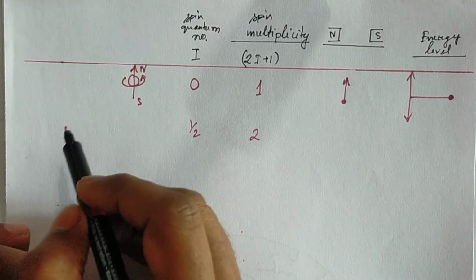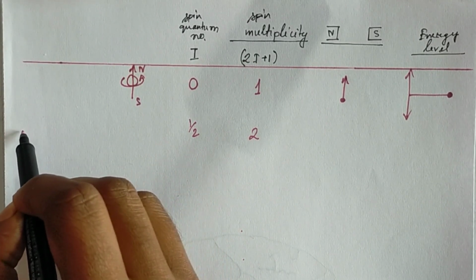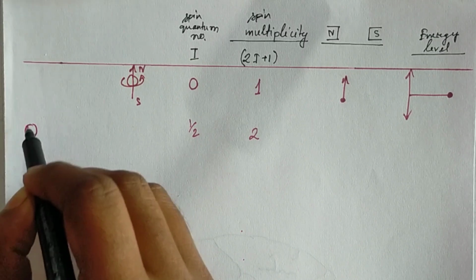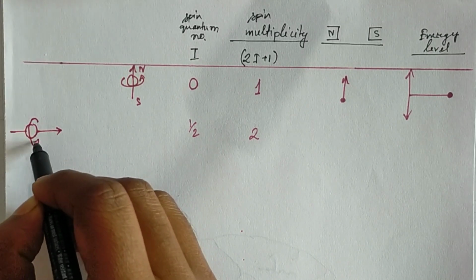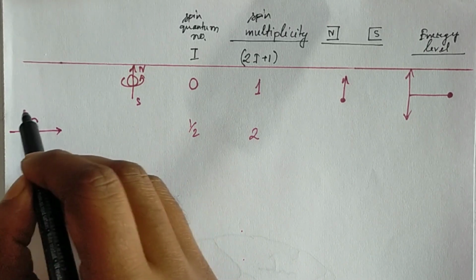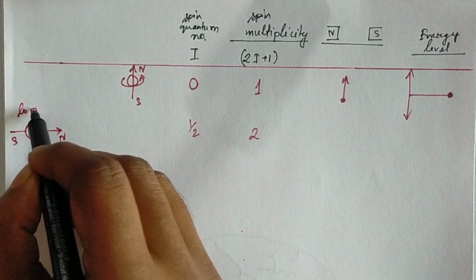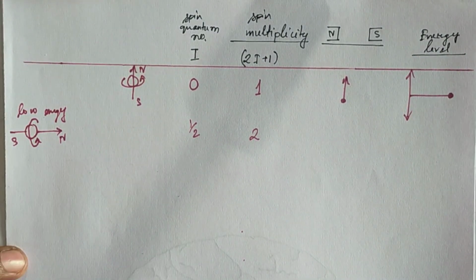How will they orient? One orientation is this one, which has low energy.